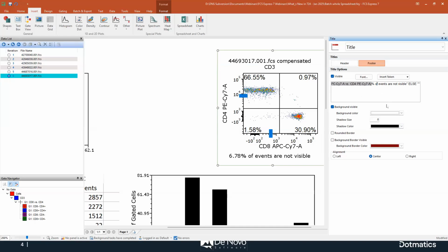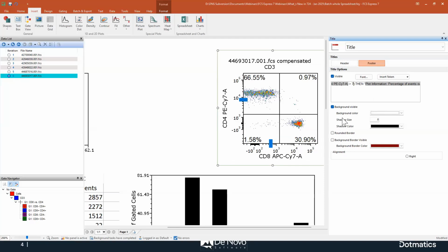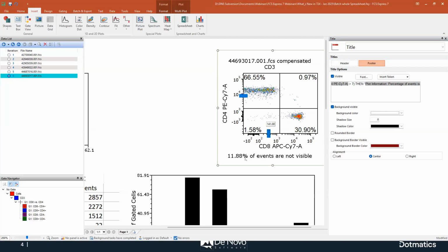And if you go to the left of the formula, okay, I'm just scrolling to the left, then you can also change the threshold. So in this case, the threshold by default is 5, you see here. So the value of this token should be higher than 5 to display this warning. I can set it to 7, and you will see immediately that this warning will go away. Okay, and it will appear only if this value is higher than 7.